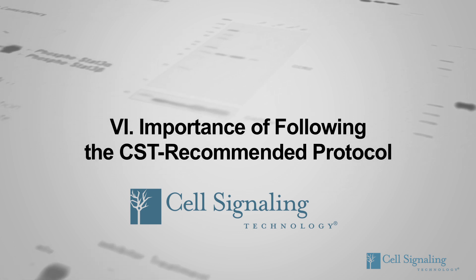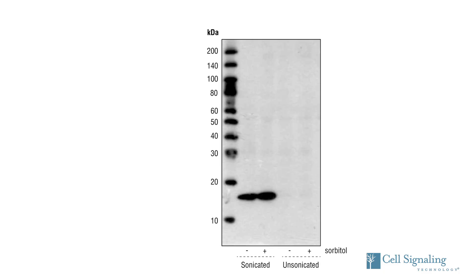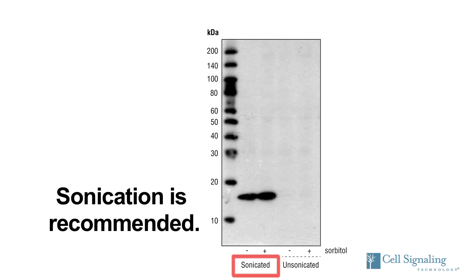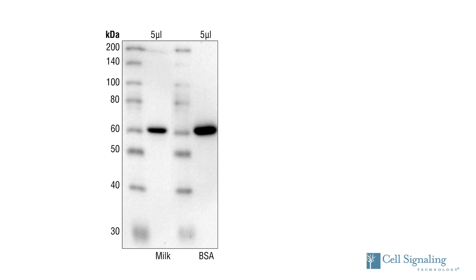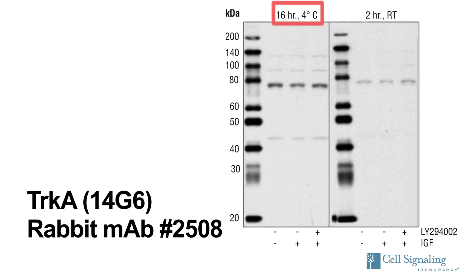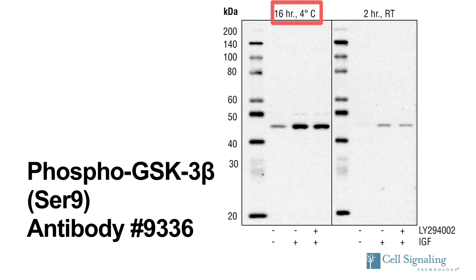Cell Signaling Technology antibodies are validated using our recommended Western blotting protocol, which has been developed and optimized by CST scientists. Minor changes to the protocol can dramatically affect the results. For example, skipping the sonication step during sample preparation can result in a greatly decreased signal, especially when detecting chromatin-associated and membrane-bound proteins. Primary antibodies can be diluted in a TBST buffer containing either 5% BSA or 5% milk; the optimal dilution buffer has been predetermined for each antibody and is included on the product datasheet. Using a dilution buffer other than the recommended one may result in a less-than-optimal signal. CST recommends incubating the primary antibody overnight at 4 degrees Celsius; a 2-hour incubation at room temperature has been found to lead to a weaker or no signal.